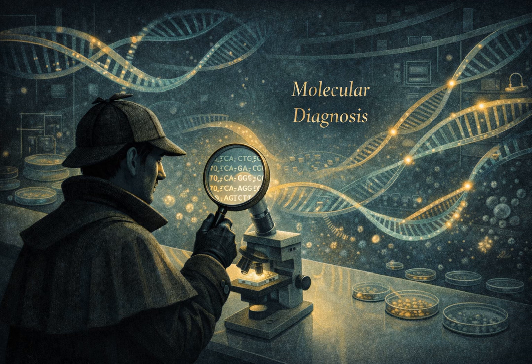How does that work? You run a normal PCR with 1 set of primers. Then you take the product of that reaction, all the little DNA copies you just made, and you use it as the template for a second PCR. But this time you use a new, second set of primers that are designed to target a sequence inside the piece of DNA you just amplified. So it's like putting a target inside a target. You have to hit the first one and then the second one.